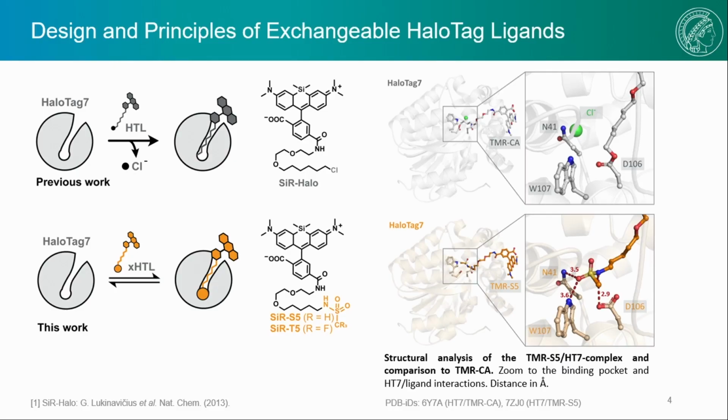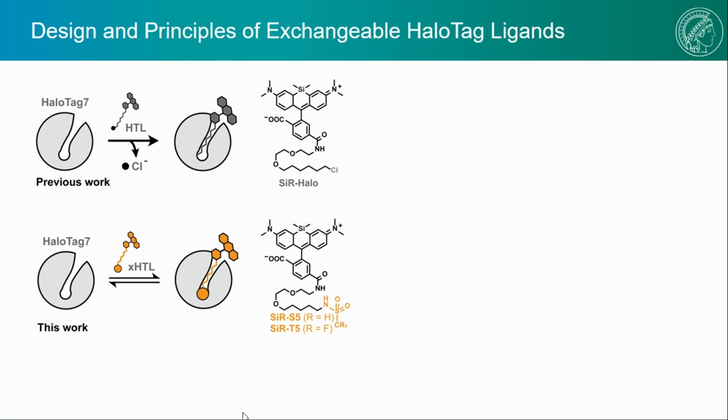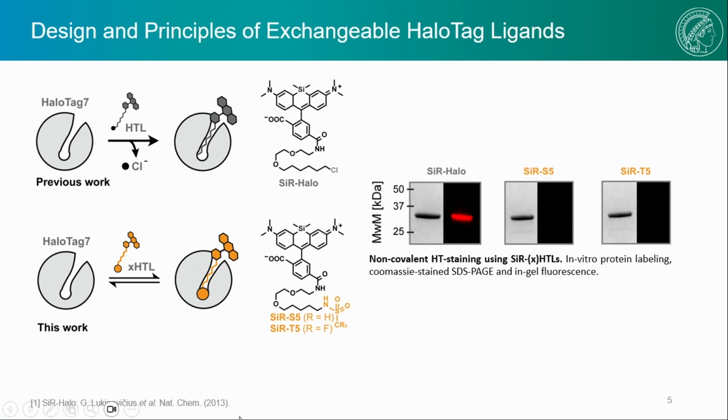Looking again at the crystal structure, we now see that those sulfonamides nicely occupy the binding site and make some polar interactions with the key residues. We next ensured that the labeling is non-covalent by performing in vitro protein labeling experiments, in contrast to the classical Halo substrate.